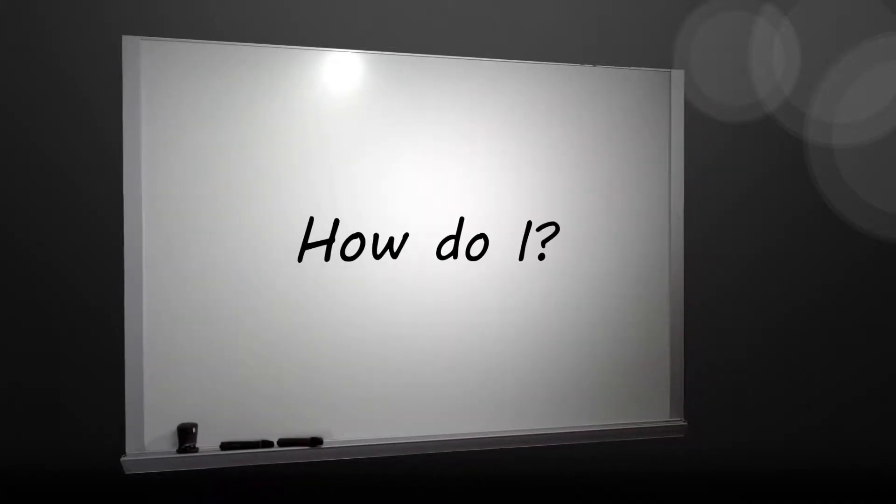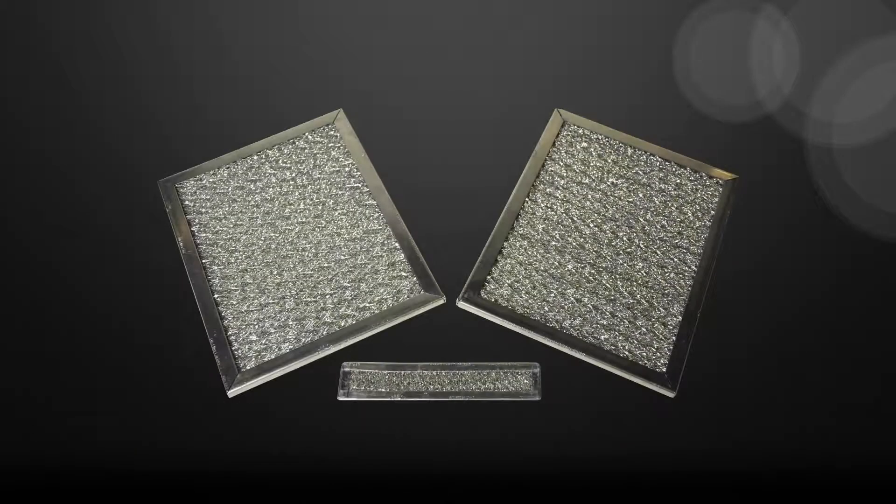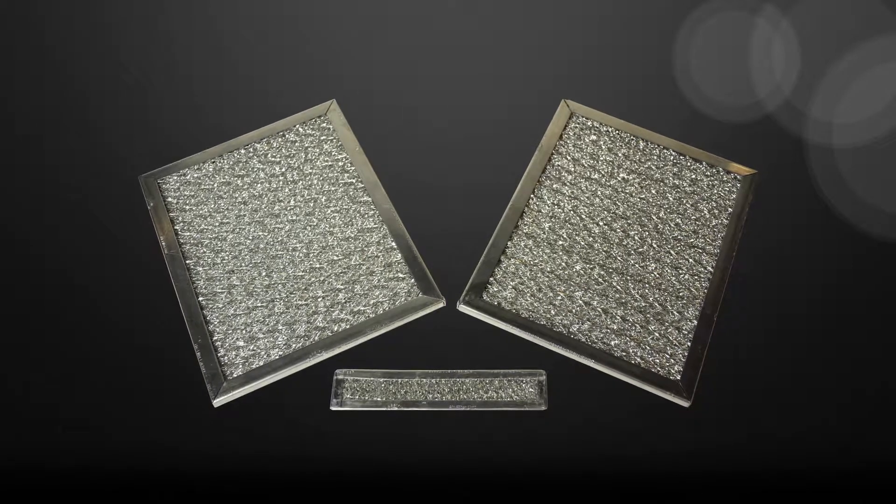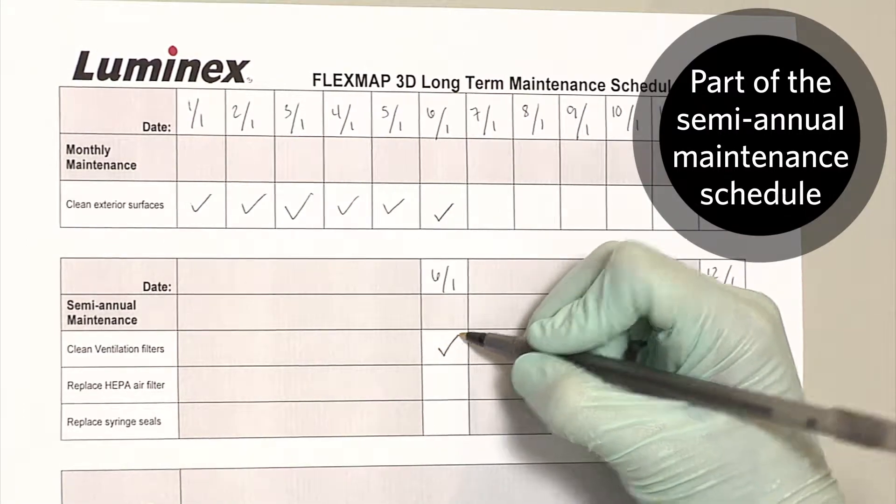How do I clean the air ventilation filters on the FlexMap 3D? Let's take a look at the procedure for removing and replacing the three ventilation filters on the FlexMap 3D. This routine is part of the semi-annual maintenance schedule.